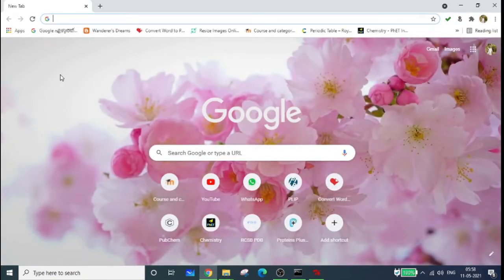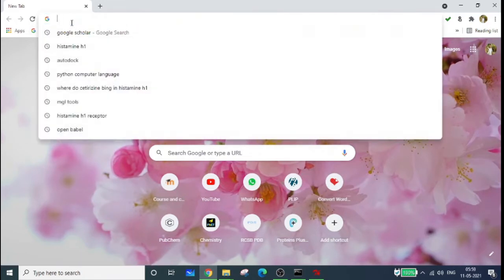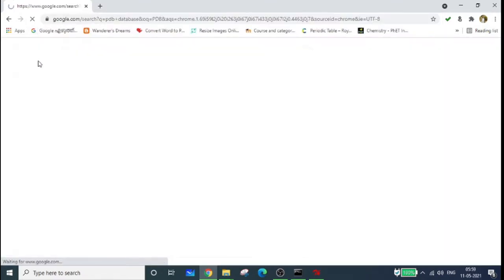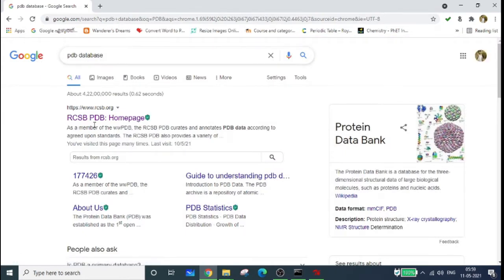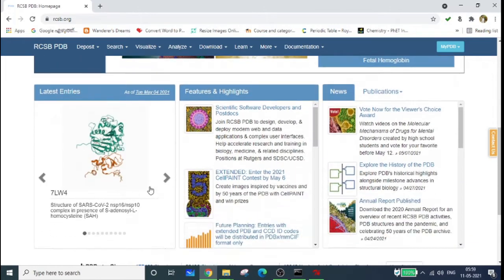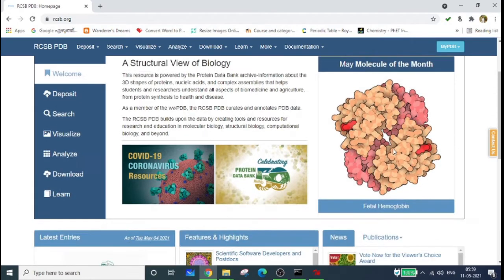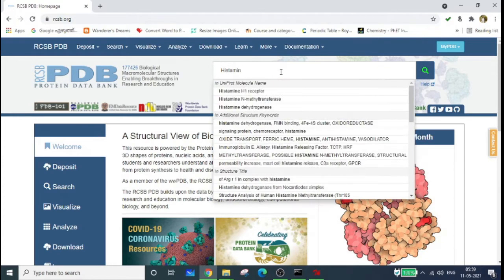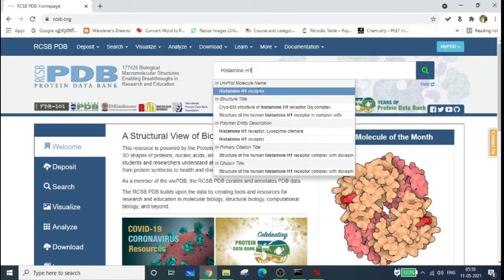First we need the structures of histamine H1 receptor and cetirizine. To get the structure of a protein, the best database is the Protein Data Bank (PDB). Go to the PDB database — just type PDB on Google and you'll get the RCSB PDB homepage. Select it, and on this page you can search for your molecule. Type 'histamine H1' and you'll find the histamine H1 receptor.